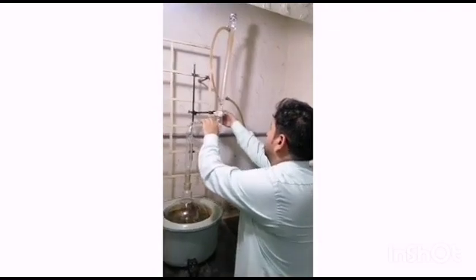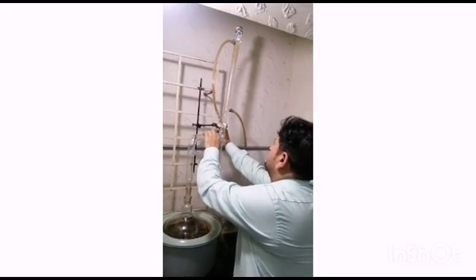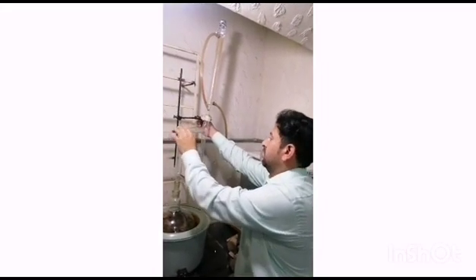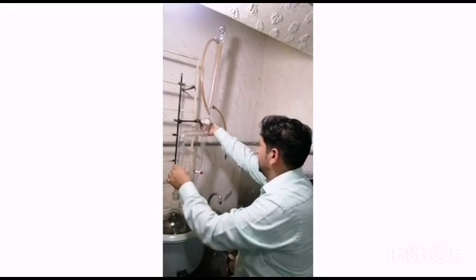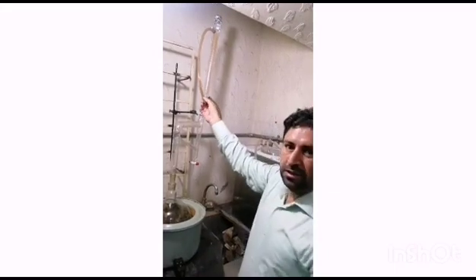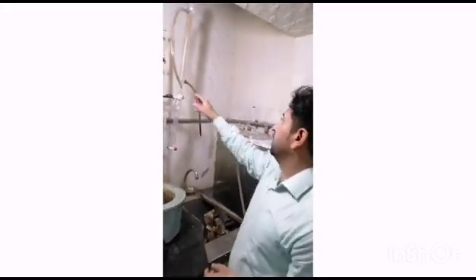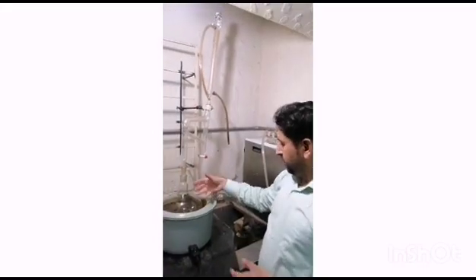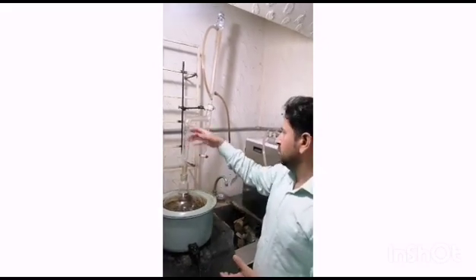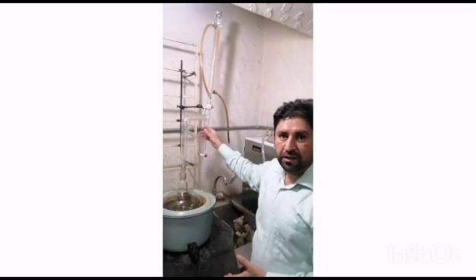Then we can secure this with a stand — this must be very tidy because it will take around 7 hours to recycle this whole process. Then we will connect this to a chiller. The chiller will condense the vapor, and when we heat it, water will move through hydro distillation from here and we can collect it here, and we will get the essential oil here.